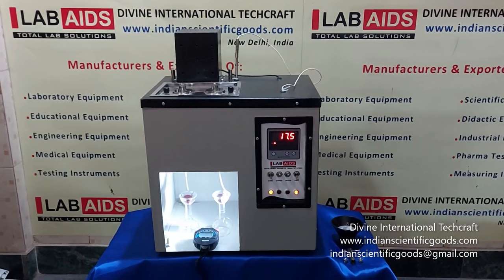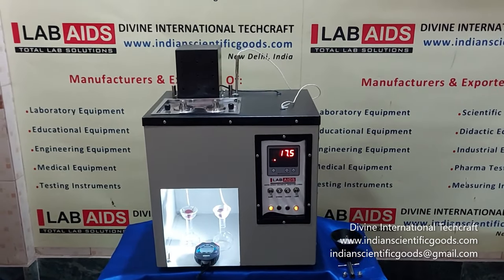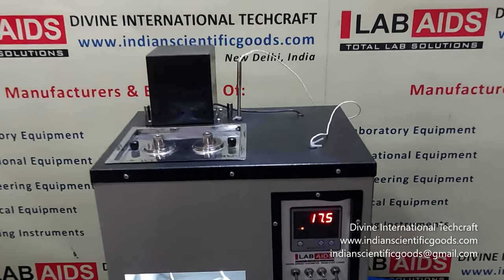Hello, this is a 2-cup digital Saybolt viscometer manufactured by Divine International Techcraft, New Delhi, India.